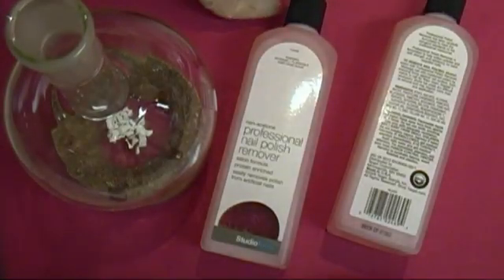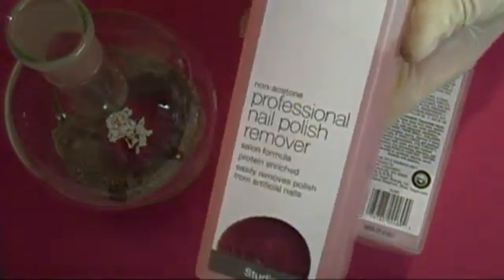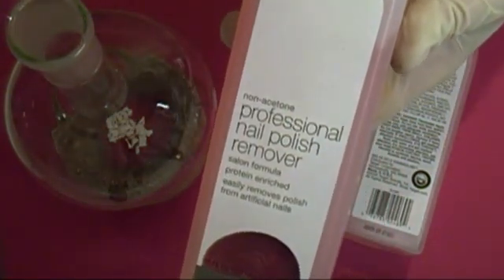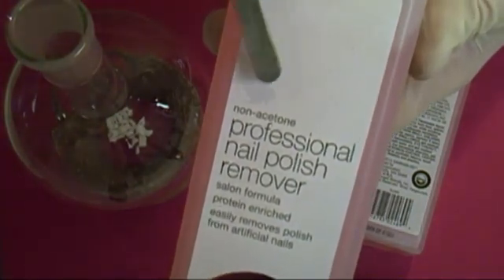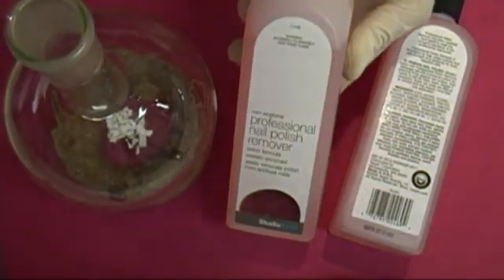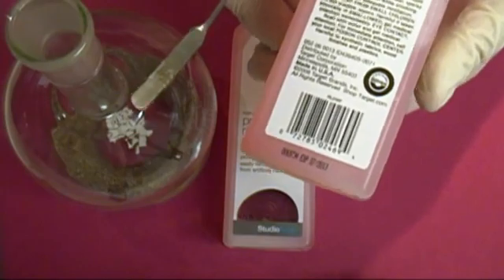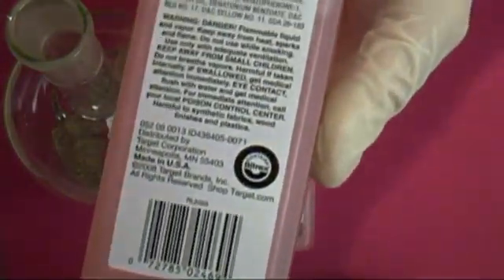Hello everyone. In this video we'll be making hot ice and ethanol from non-acetone nail polish remover. To start, you'll need some non-acetone nail polish remover. The non-acetone polish remover is made from ethyl acetate. Be sure that ethyl acetate is listed in the ingredients, preferably first.